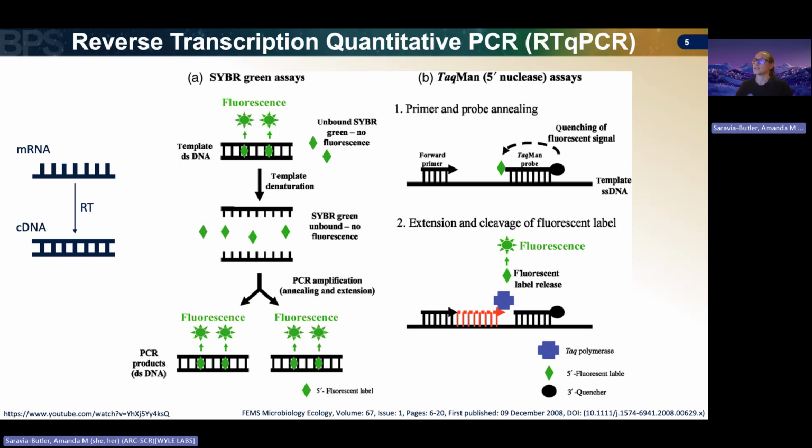Then when polymerase is recruited on your primer, it synthesizes the complementary strand from your target, eventually reaching your probe and bulldozing through it, releasing the fluorescence because it will then be far enough away from its quencher to release a signal, which you will then detect.